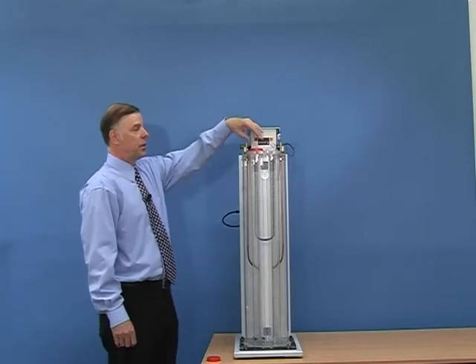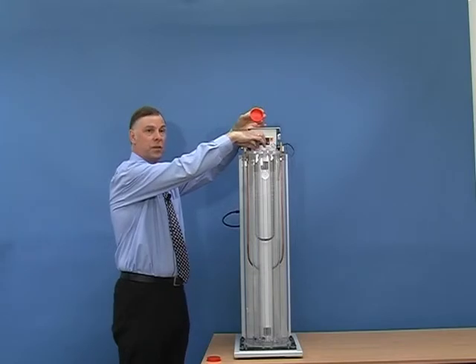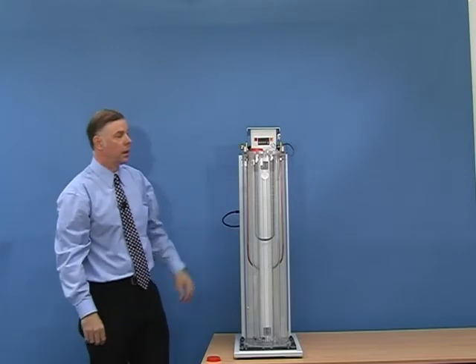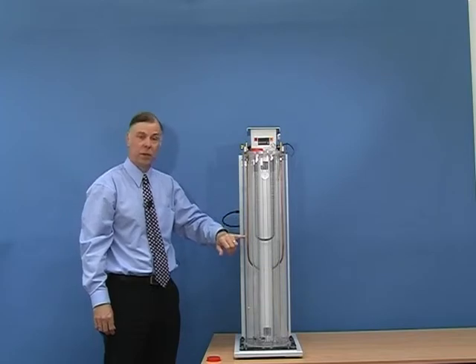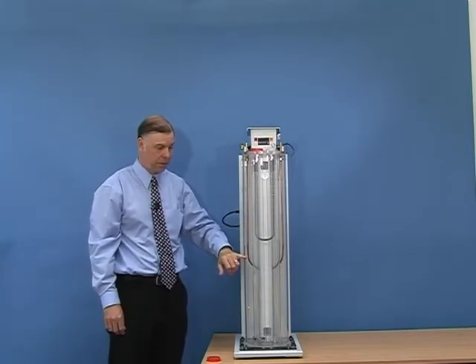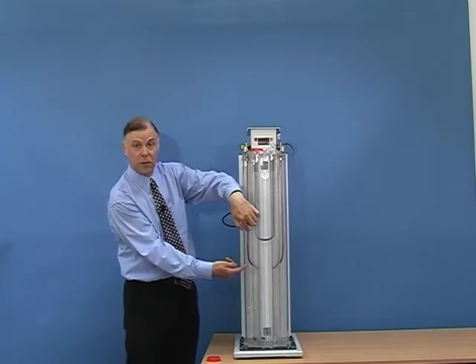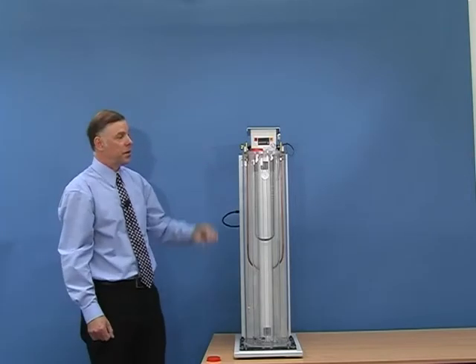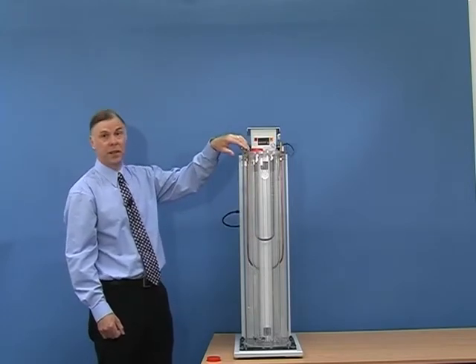To test the density of the polymer, we just remove the cap, carefully introduce the sample into the top, and replace the cap. The sample will very slowly sink in the fluid until it reaches its own density, when of course it will stop. The exact density is then calculated by the known densities of the floats above and below it. After many tests there will be lots of samples in here, and it will be difficult to see which one you've just entered.